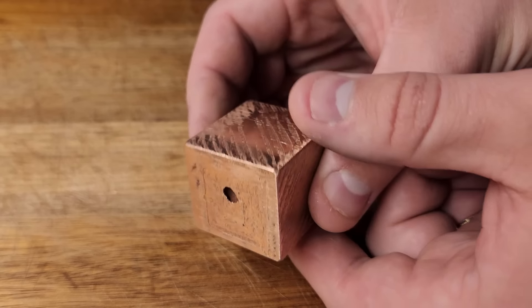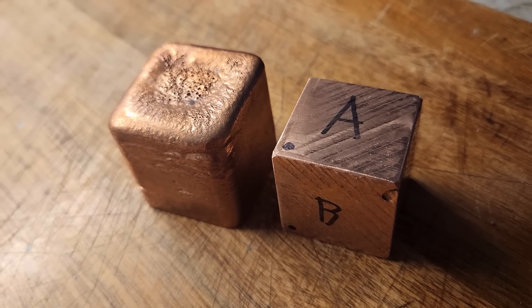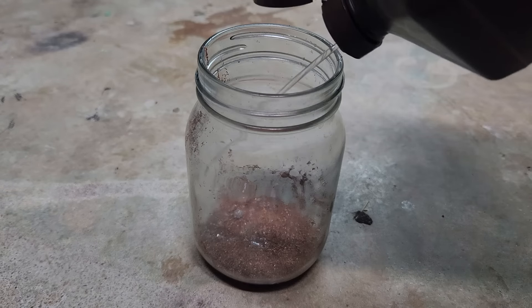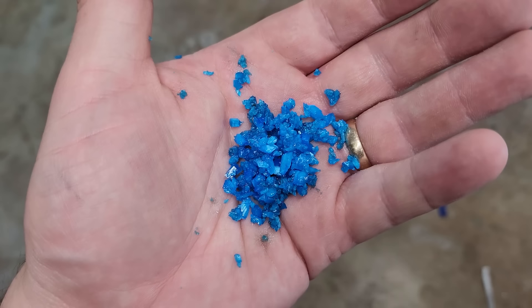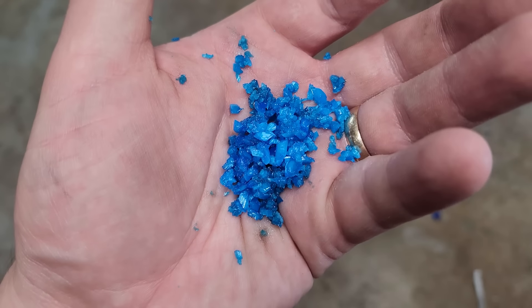It actually came out pretty nice, and it's oddly satisfying to hold and play with. As for the shavings, I scooped them up into a jar and poured in a little bit of hydrogen peroxide and then some sulfuric acid. You can see them turning back into copper sulfate, and after filtering and boiling off some of the solution, I'm back to the little blue crystals of copper sulfate that I started with. And that's pretty much how the circle of life works.